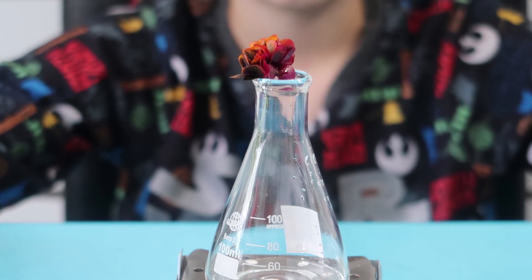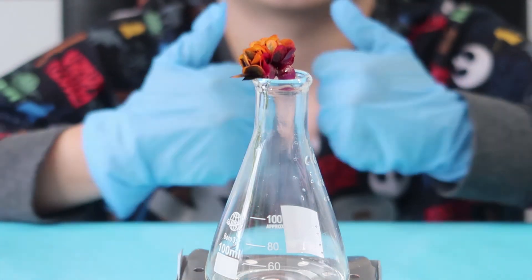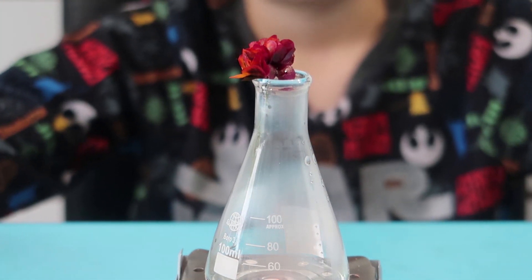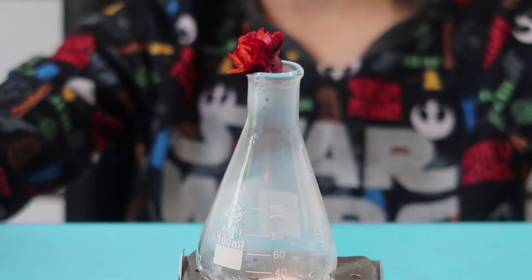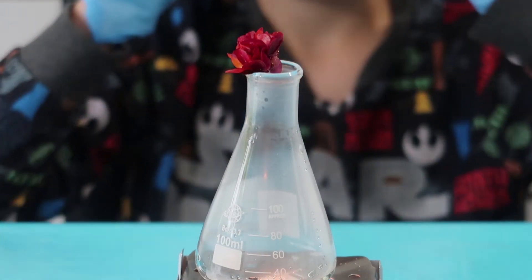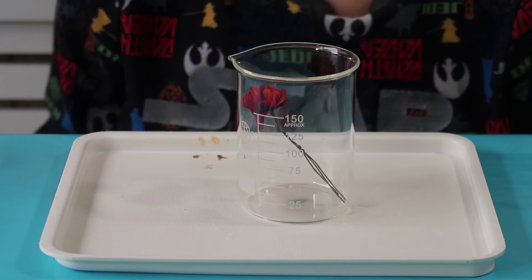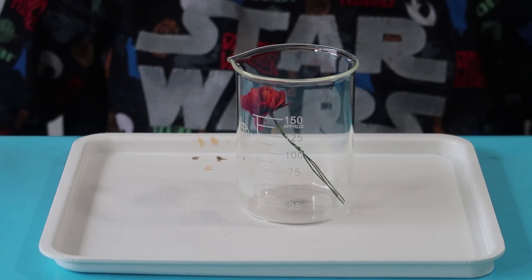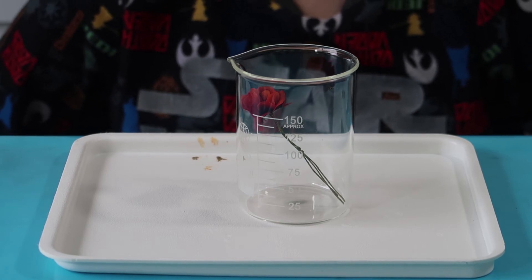That's pretty cool. It takes about three minutes and it should change completely red. Now I've moved that and put the flower into the beaker. Now that it's not being exposed to the sulfur dioxide and it's being exposed to air, some of the sulfur dioxide is going to vaporize and then the indicator is going to turn orange — so now it should go to orange.